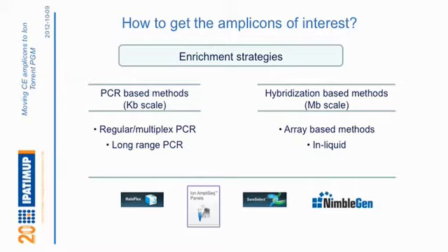We looked at pros and cons of the different technologies, and nowadays you even have a lot of commercial technologies that you can use to do this type of enrichment. But actually we went for the most basic one. So we approached this the most simple way that we could. We used just regular PCR and adapted a little bit the multiplex PCRs that we had for our panels and adjusted it slightly to get good reads on the Ion Torrent PGM.